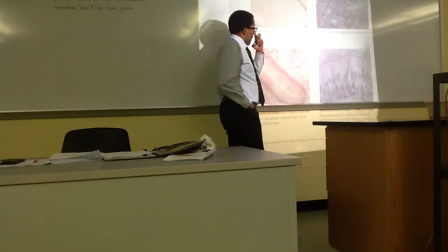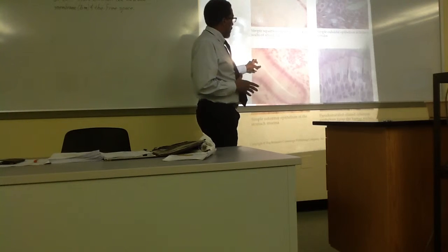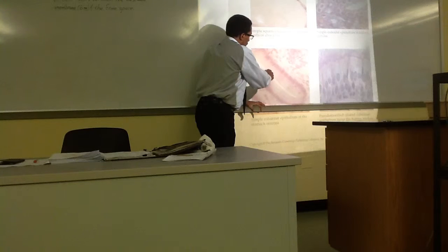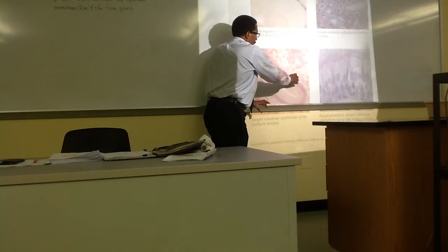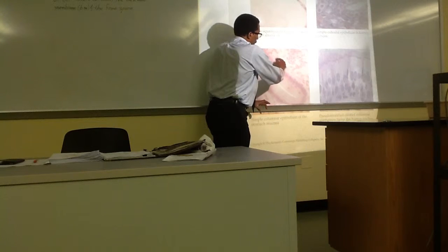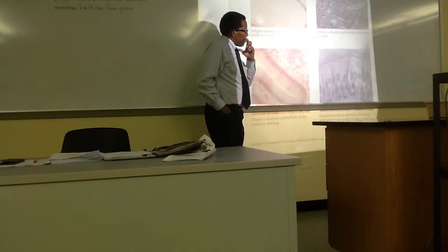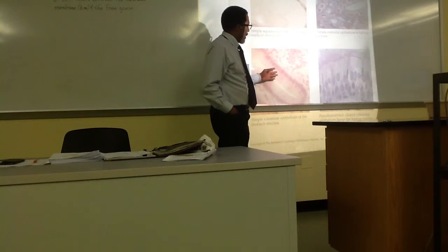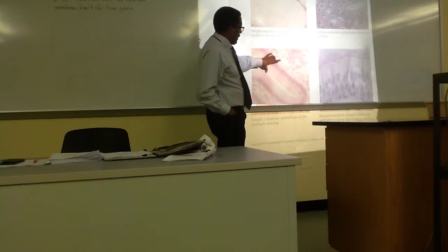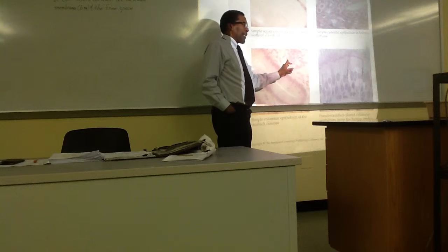Another characteristic of epithelial tissues is that they will be located between the free space, this colorless region, for example, here, and a boundary called a basal membrane, okay? The basal membrane is made up of different molecules that are produced and secreted by both the epithelial tissues on one side and connective tissues on the other side.